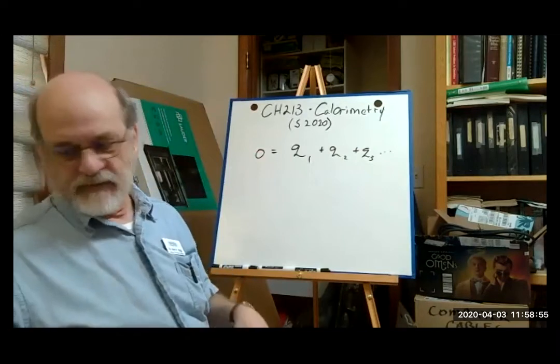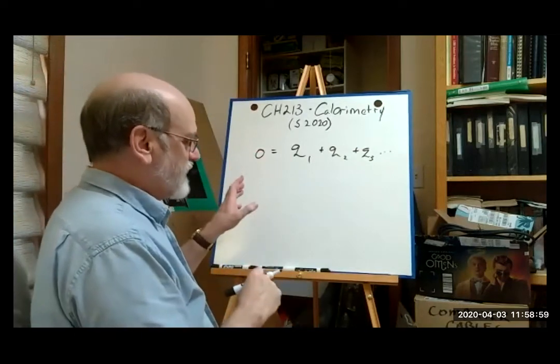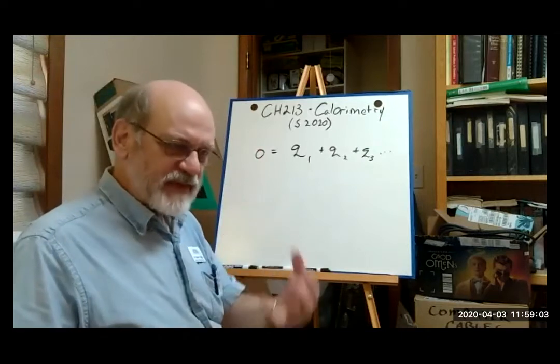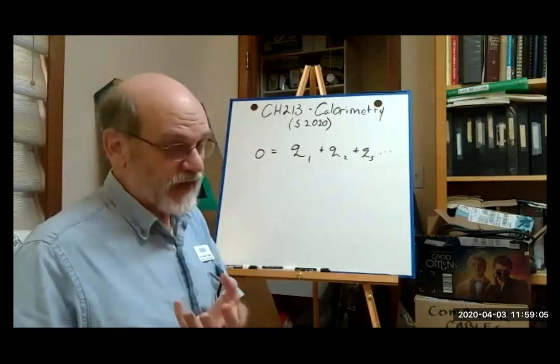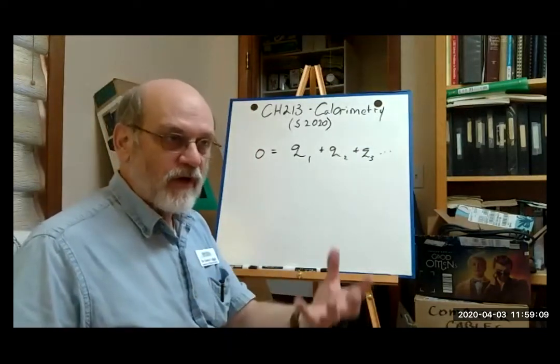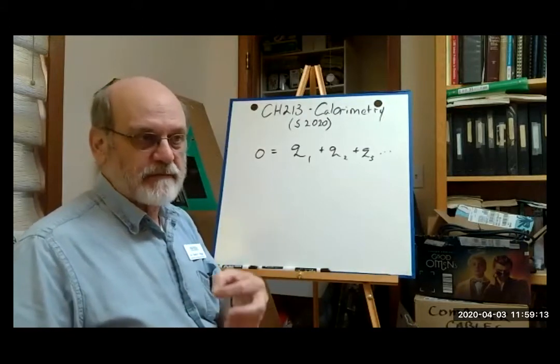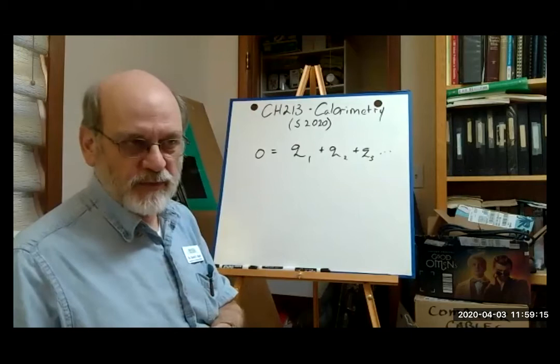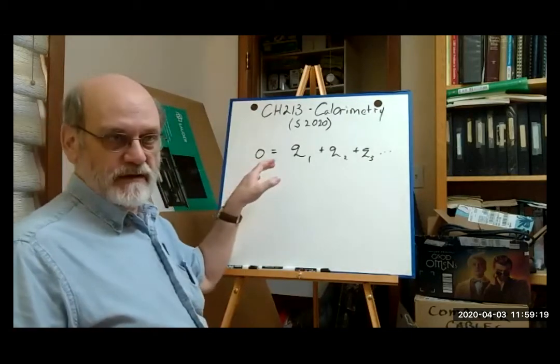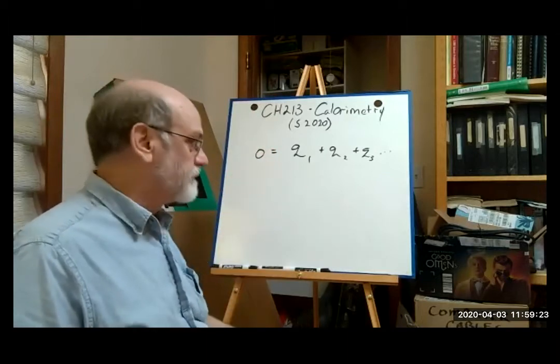All right, so that being said, we know that a calorimeter has the ability, even though it's a very good insulator, to absorb heat or evolve heat. Not very much, but enough to significantly change the results of your experiment if you do not account for that heat, the calorimeter's ability to absorb or evolve heat. Right?